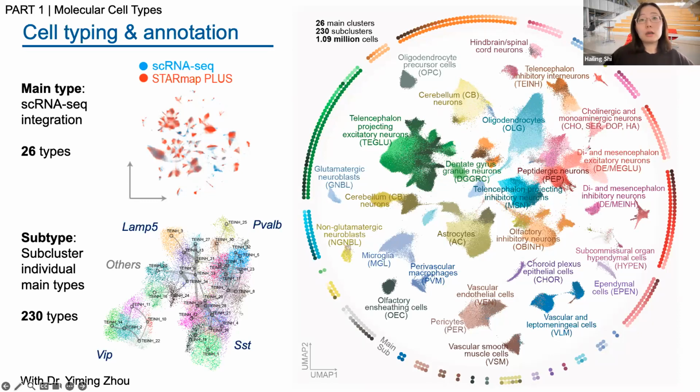So we do have to filter the gene list based on certain criteria to get better clustering results. The nice thing is that with the spatial information, we can always refer to what people already know about the distribution of a certain cell type in the brain sample. So we were able to confirm using the spatial information whether we have the right clustering parameters and conditions. The cell typing itself is just based on single cell gene expression, and we have the spatial information as orthogonal information to validate our clustering performance.